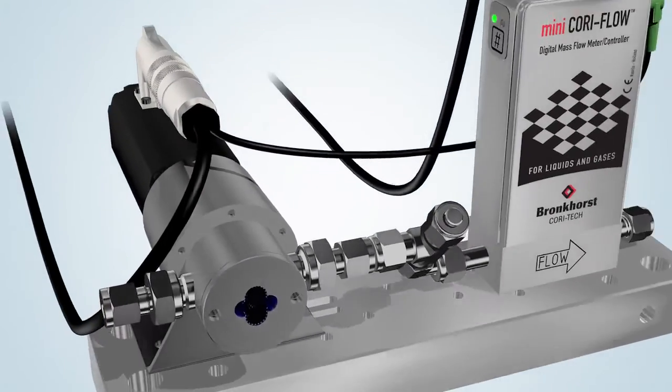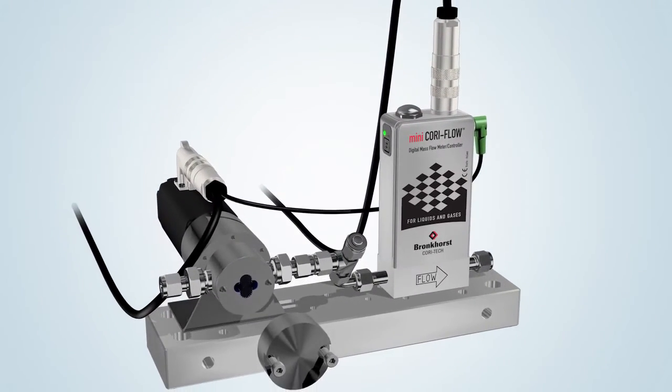The gear pump makes it possible to raise the pressure and induce liquid to flow through the flow meter.